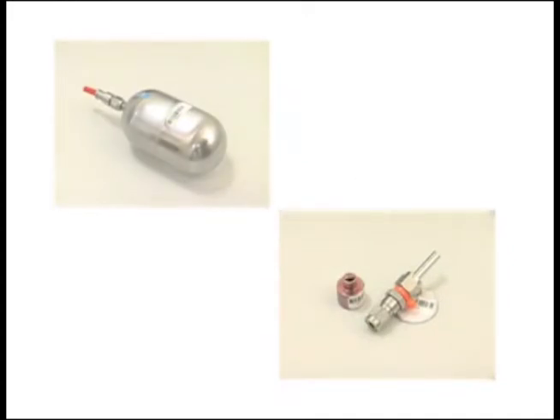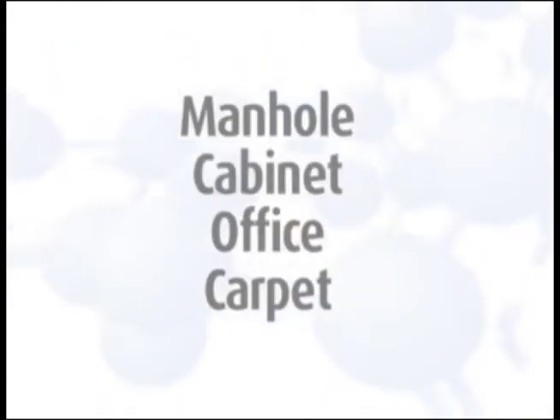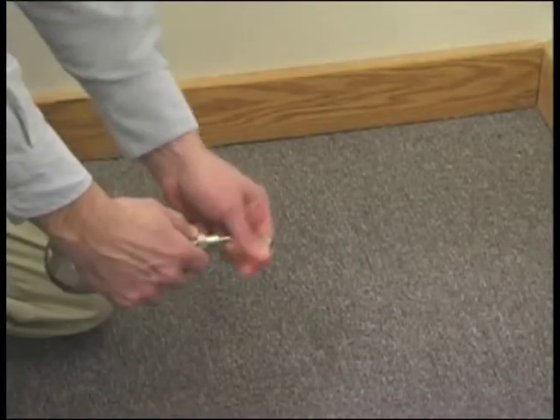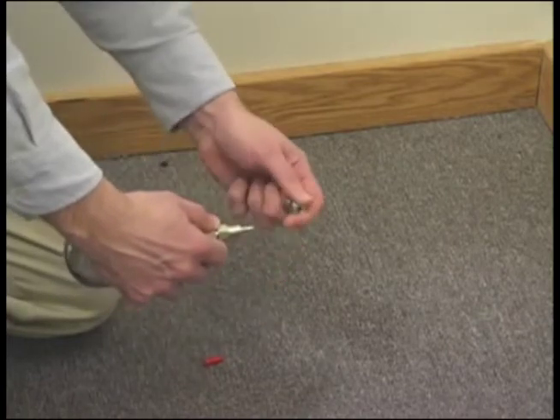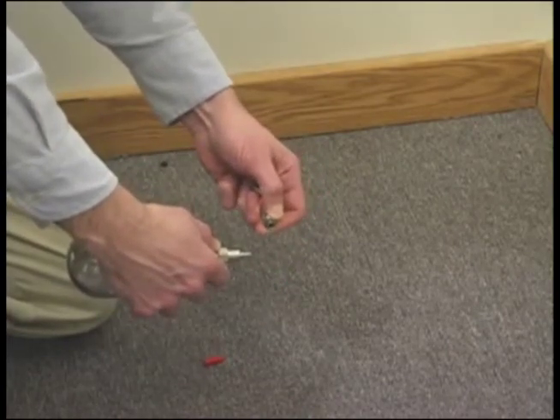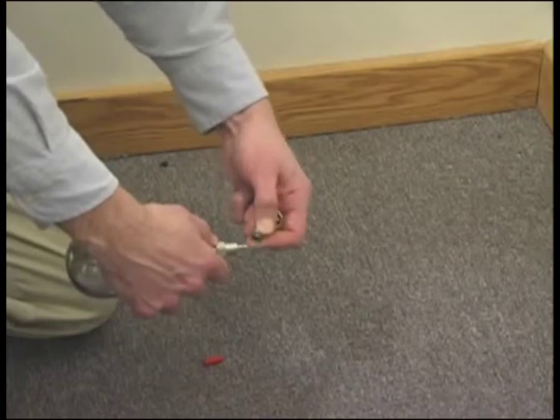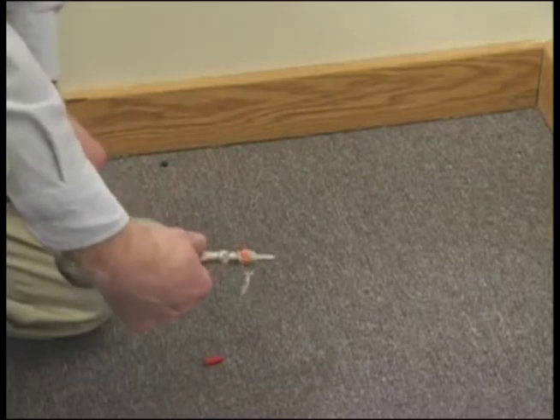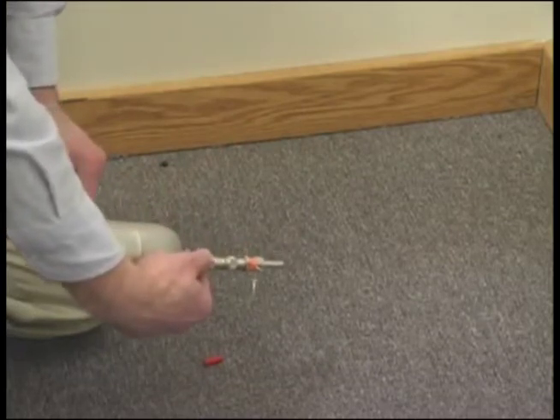Take the can and grab regulator to the sampling location. This could be a manhole, cabinet, office, carpet or something else. Remove the protective cover from the mini can sample intake stem. Point and hold the can at the spot where you want to collect your sample. Hold the grab regulator in the other hand and slide back the collar. Insert the can's sampling tip into the grab regulator and release the collar.